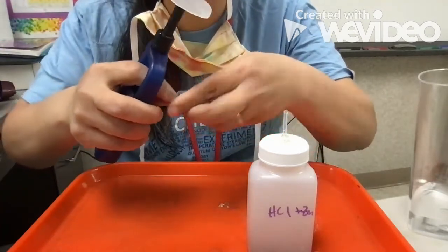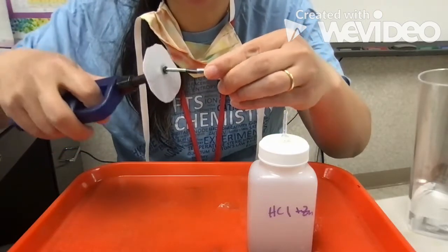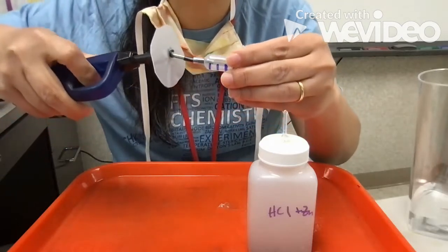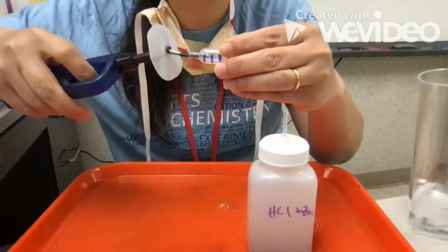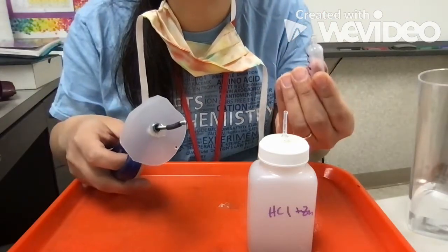Make sure that you're holding the rocket really tightly. Okay, so hold on to the rocket and then spark. Interesting. When it's hydrogen, I don't see anything, huh? Okay, so that's the first test.